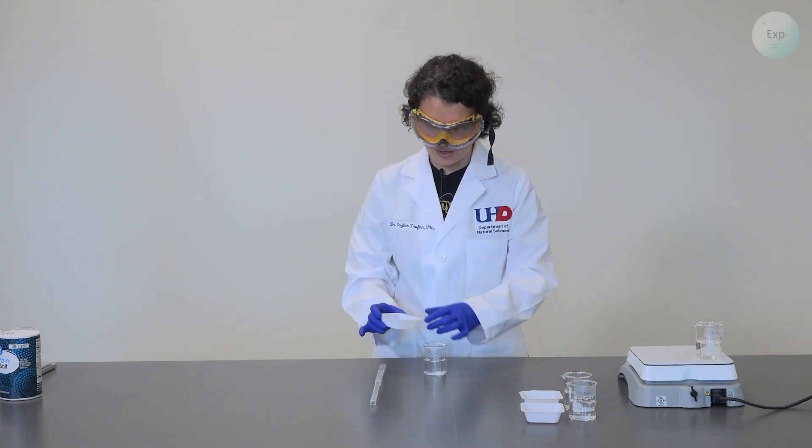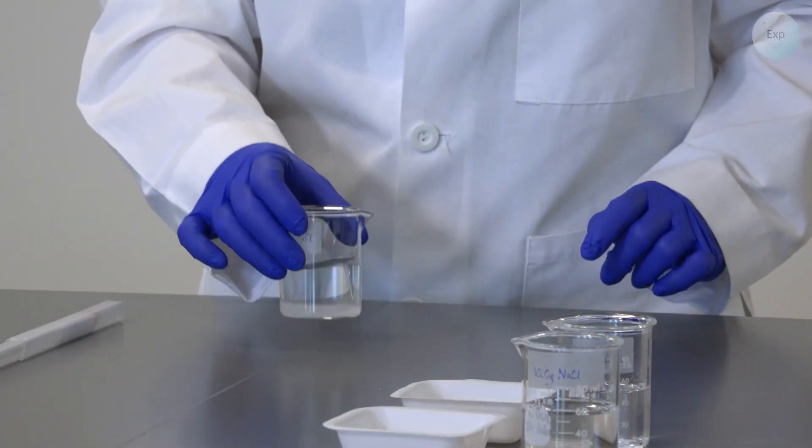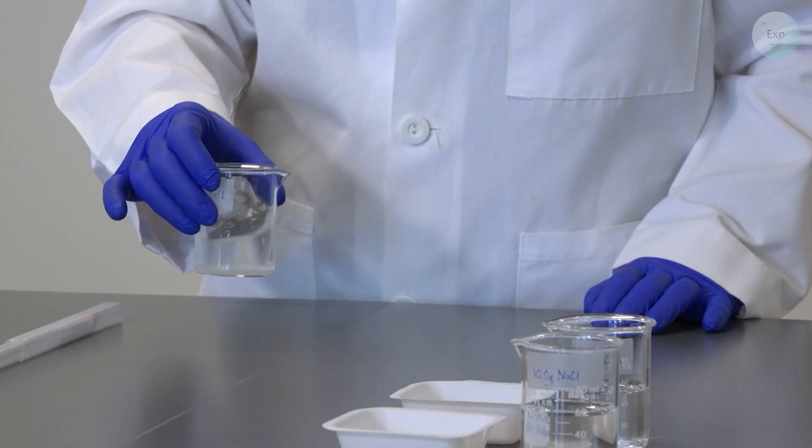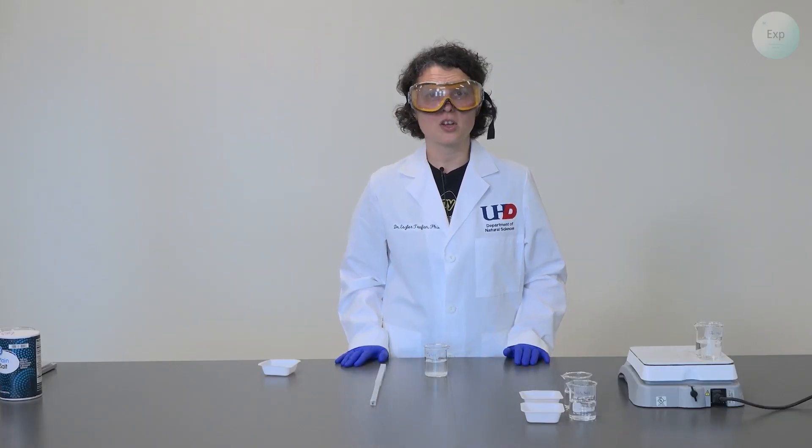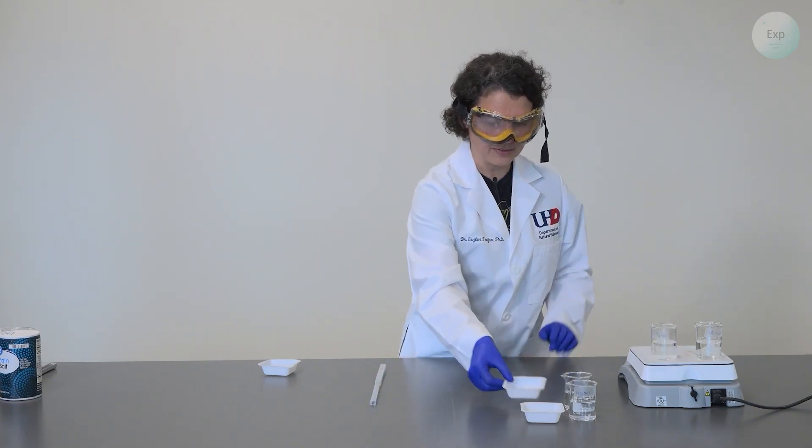Next, I will combine my 5 grams of sodium chloride with the water. I may swirl it a little bit. But typically, heating the water is going to help dissolve the sodium chloride faster. So I will place this also on the hot plate.